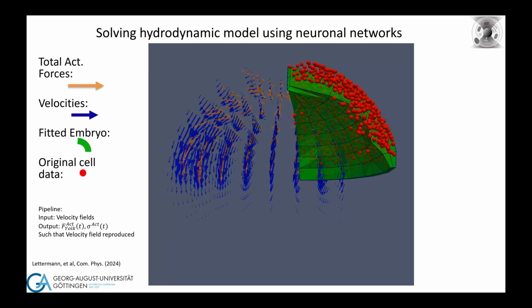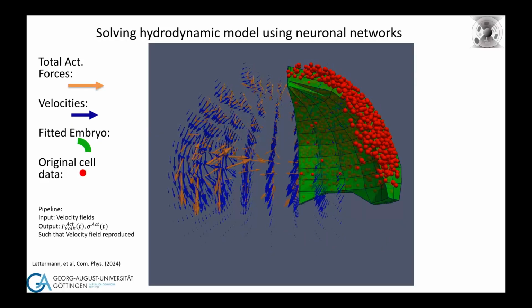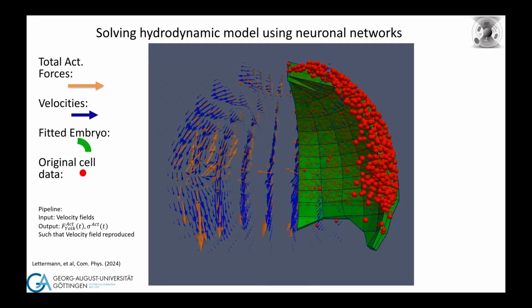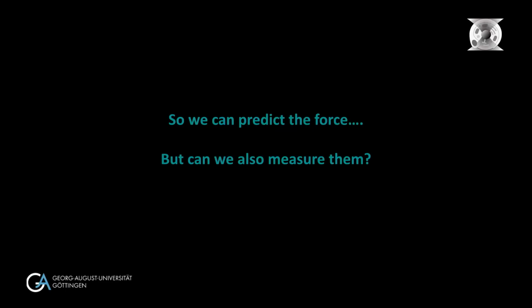But you might say, well, come on, that's really far-fetched because A, we assume it's a liquid. I think this is actually a good assumption. But B, we claim to know the viscous properties of the system. This is something that's really hard to know. So to really understand what's going on here, what we need to do is we also need to measure the forces and compare it then to these predictions. And this is really the question that I want to address now.